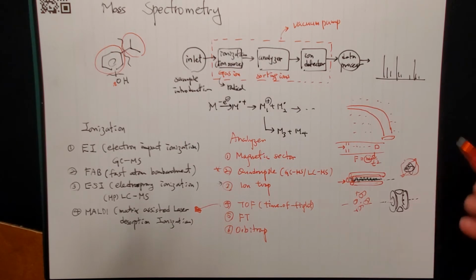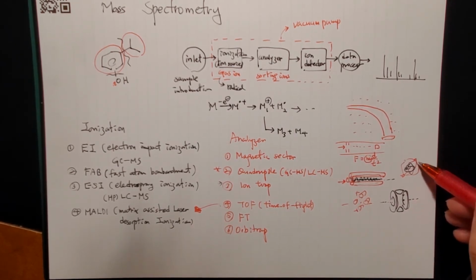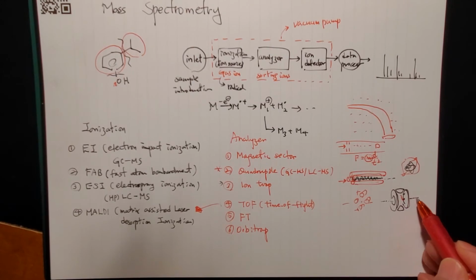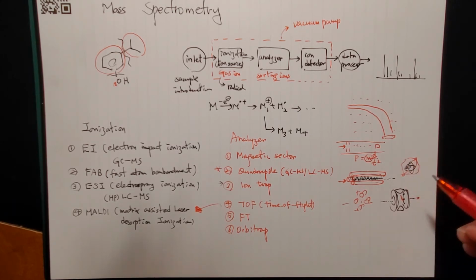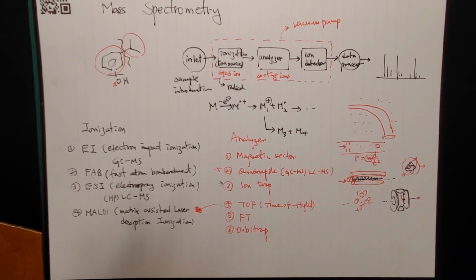At some point you can control a certain mass, make it take the right flying path, go through a little puncture and get detected. Those are mostly the lighter ones. You have a certain electric force exerted on them and have them move out, exit first.